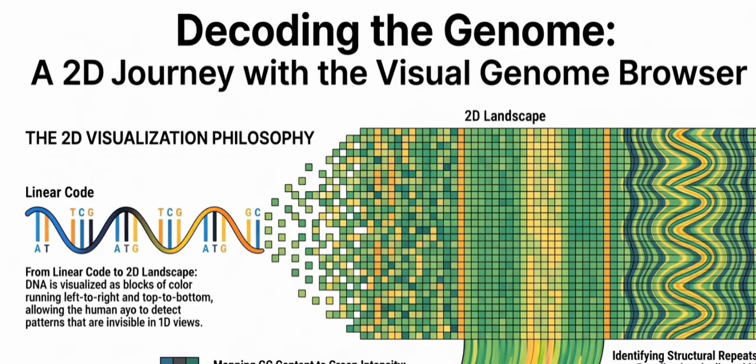And that takes us to the final, most complex section of the notes you provided, cross-referencing, utilizing VCF overlays and local alignment tools. Right. Let's get into VCF files. So when a clinical laboratory sequences a patient's DNA, they do not generate a brand new, massive 3 billion letter text file from scratch. The computational and storage overhead would be catastrophic. You'd run out of hard drives.